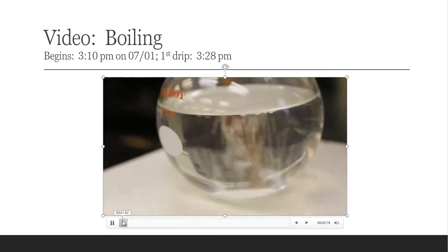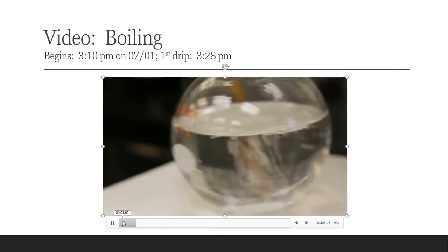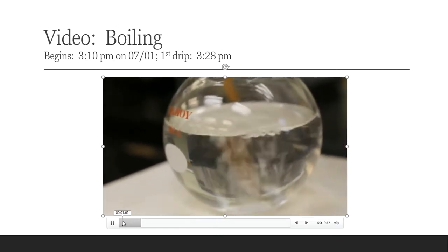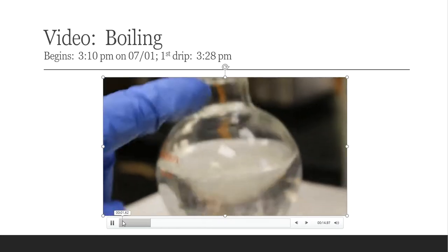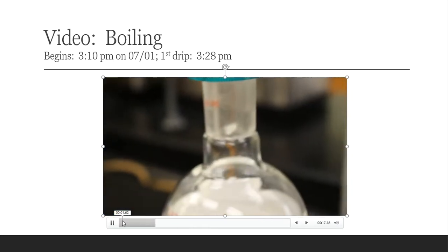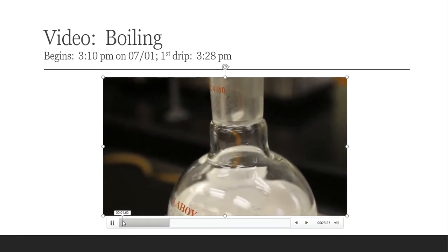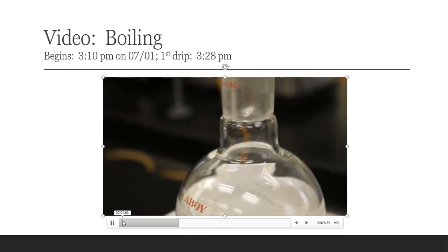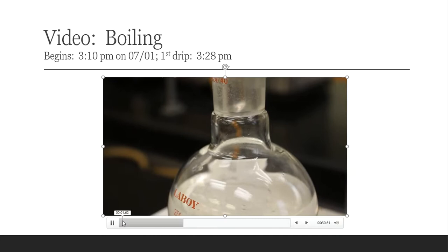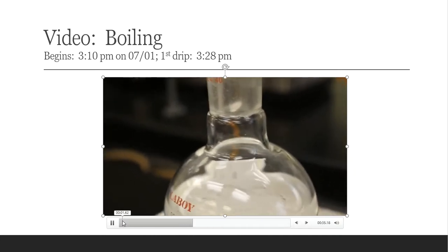So this is the boiling flask with my petroleum ether, really a Florence flask. It's just now beginning to boil. So I've recorded that time down. And from the neck of the flask, I'm starting to see a few drips that are happening. However, I haven't yet seen those drips in the actual Soxhlet. That ether still has not made its way into the thimble area yet where my peanuts are. So I recorded this time down so that we'll have it in our lab notebook.